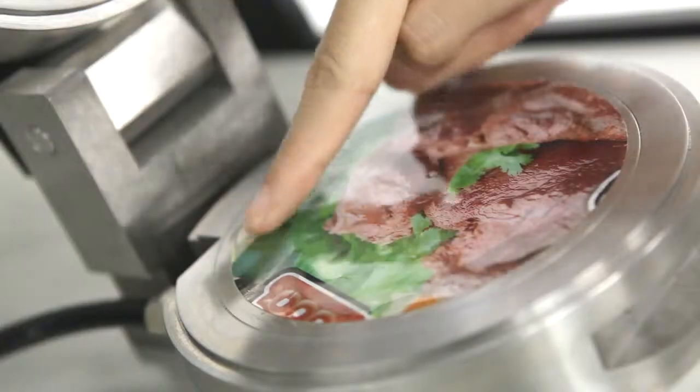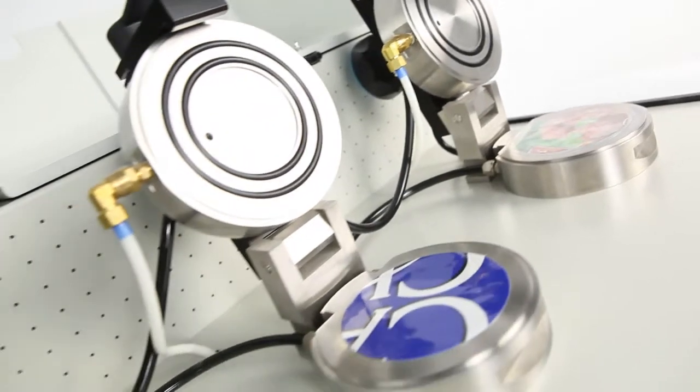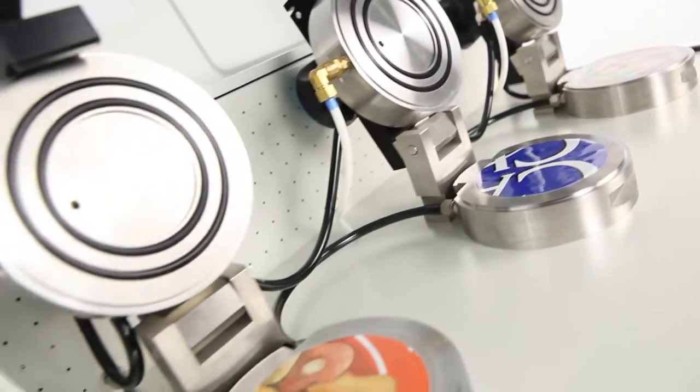make it of great application value in the field of flexible packaging R&D and production.